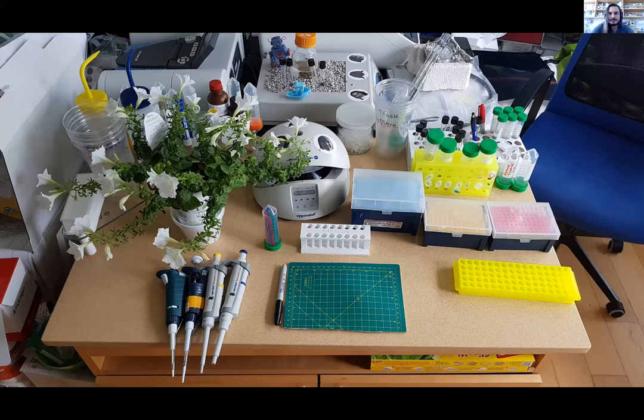Okay, so here we go. This is an image of my lab day to day. There's petunias and pipettes and little robots and stuff, but essentially the core of what I do is explore the natural world through whatever means I have and then share with everybody on whatever channel I can find. And in the process, I hone my abilities, but then also I start realizing that there's a lot of hardware that's missing or a lot of particular facets of research that are either way too expensive or way too inaccessible for the amateur, especially amateurs in countries that don't have access to a reliable cold chain, or they charge incredibly high taxes for moving very cheap goods from one country to another.